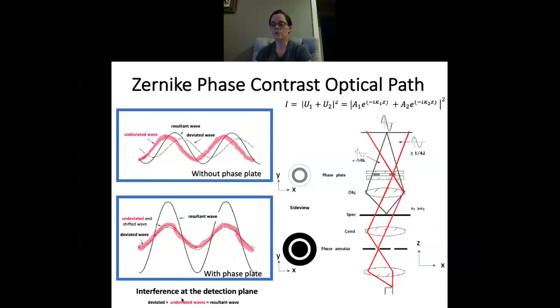On average, you'll have a delay from a typical sample on the order of a quarter wave, about 200 nanometers. A quarter wavelength lag produced by a sample, plus the quarter wavelength jump given by the background light, will give you a total of a half wave shift, which is ideal to produce high contrast interference.